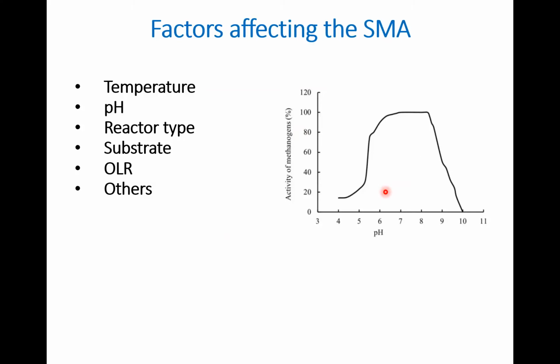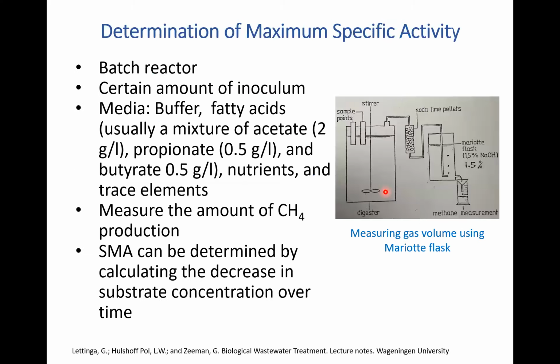But in reality, if you would like to determine it, we would need to have optimum conditions for microorganisms to work. In this case, we can conduct a batch experiment in a batch reactor, as we mentioned before, maybe some kind of Marriott flask or some other simple system for liquid displacement.